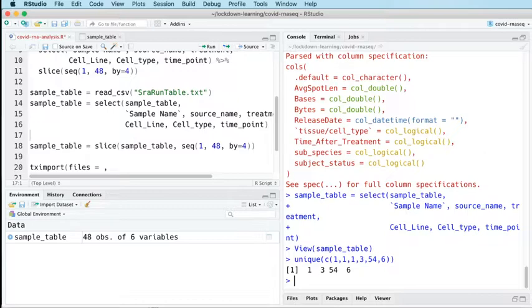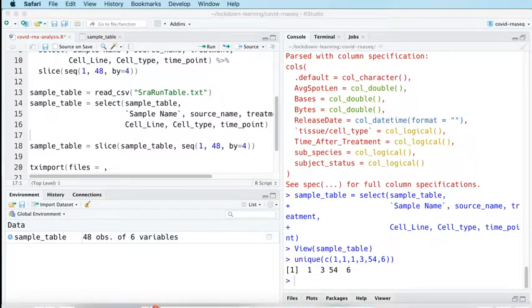Whether there's an easy way of removing duplicate rows, I suspect dplyr gives us an easy way. I'm just, as I'm mugging to the camera, effectively looking online to see. I wonder if unique works. Let's have a look.